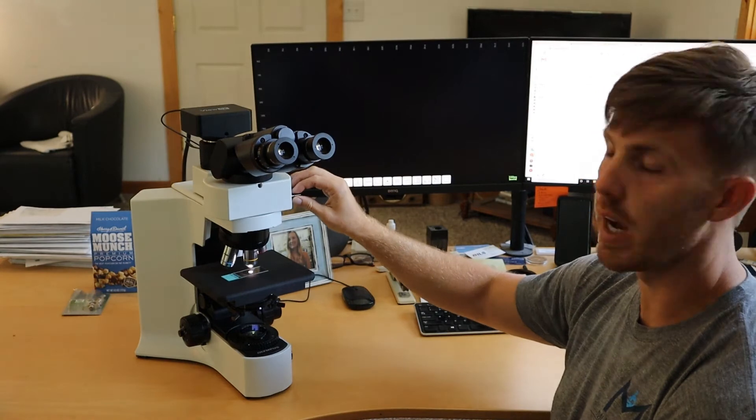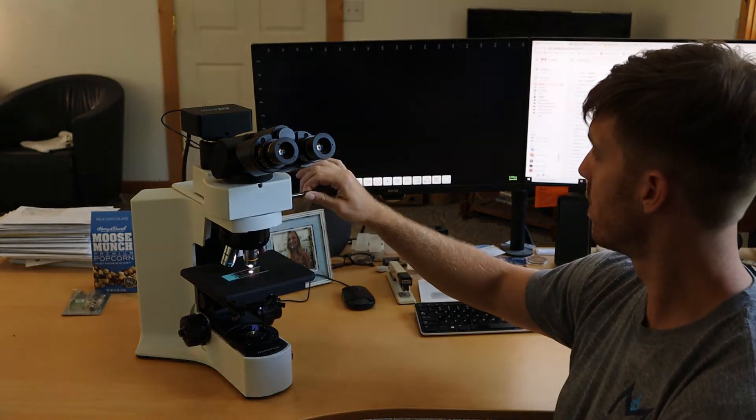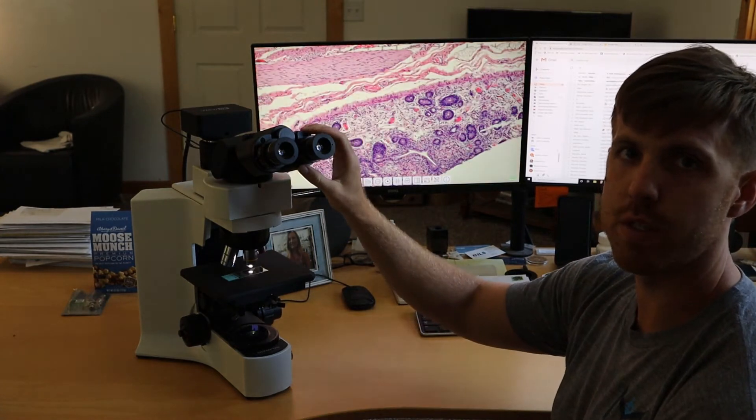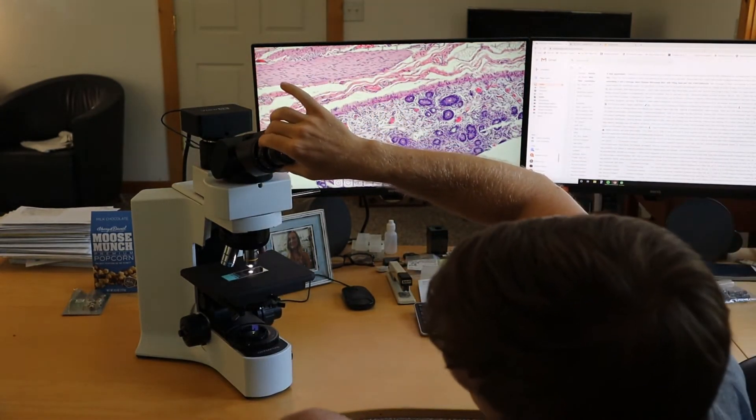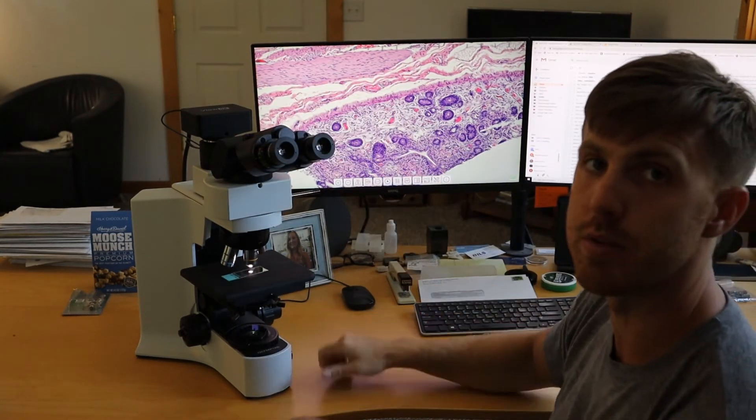Hey, this is Chad with Monday Scientific, and today I'm going to show you how to parfocal your camera adapter. The first step is to make sure the light is being sent to the camera, and then you want to bring the specimen into focus through the eyepieces. The diopter tube on the left or right needs to be on zero.